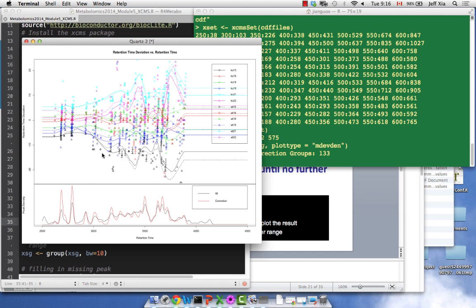So far, everything looks fine, but in certain cases, if you really see samples far away from these major groups, the drift is quite different. It probably means something with the instrument. So far, it seems all more or less close and seems normal.